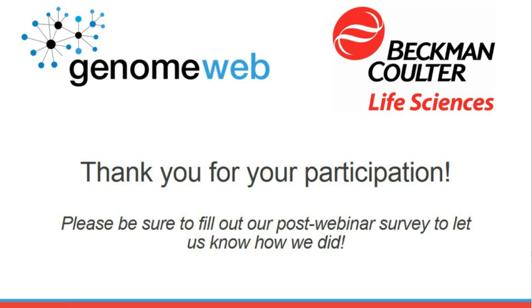And how do you control the evaporation when working at the nanoliter level? That's a very interesting question, because we could go even lower than 1 microliter to 25 nanoliter of the liquid.